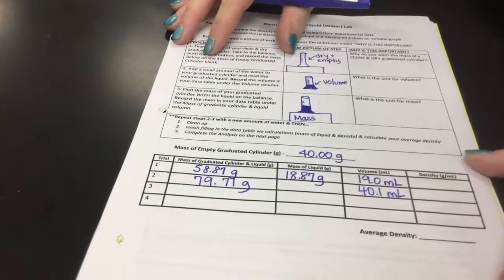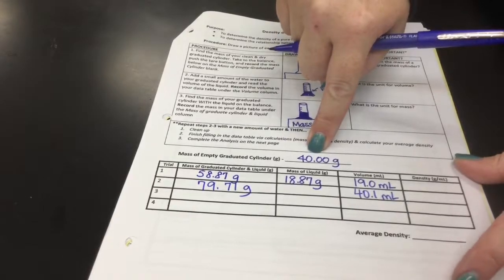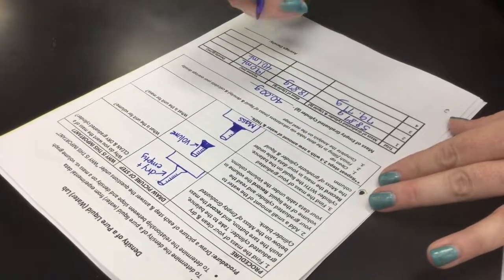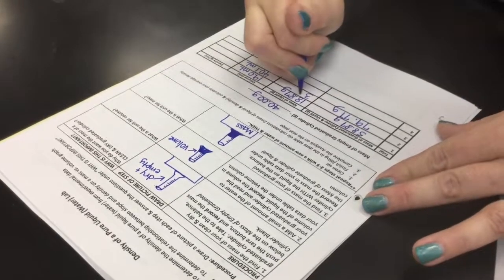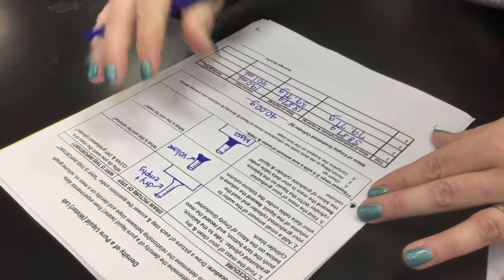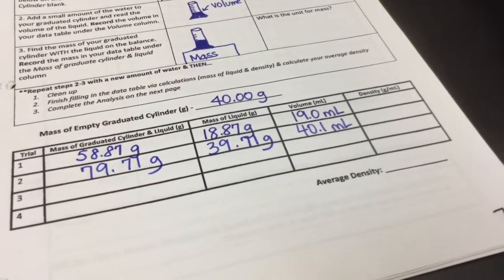Okay. So now I do 79.71 minus 40.00, and I get 39. I'm like, brain break. 39.71 grams. Grams because it's mass. Look at her units. They're different. She put milliliters for volume and grams for mass. Okay. All right. Add more water.